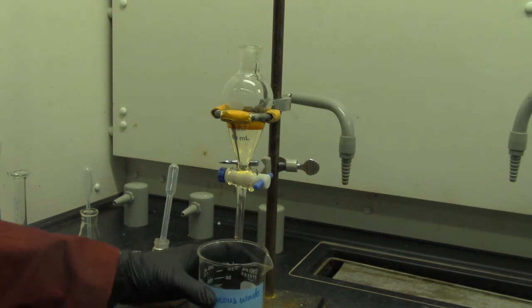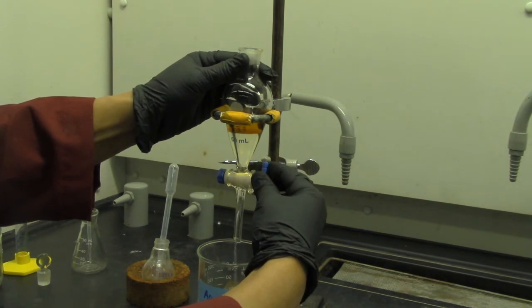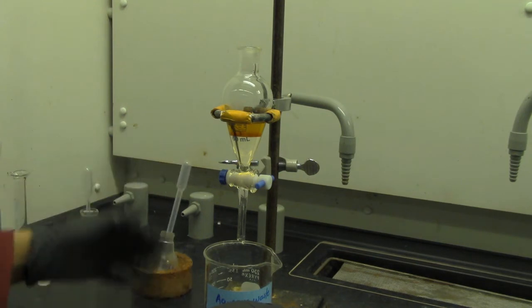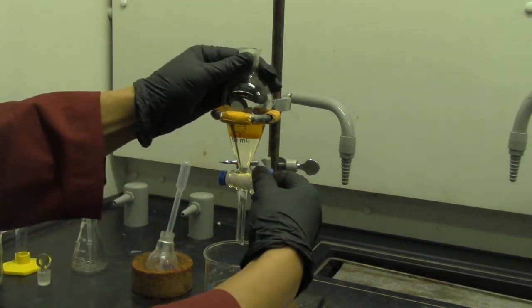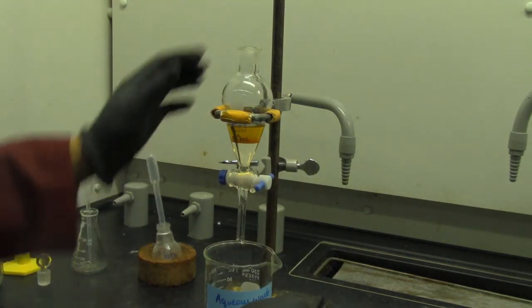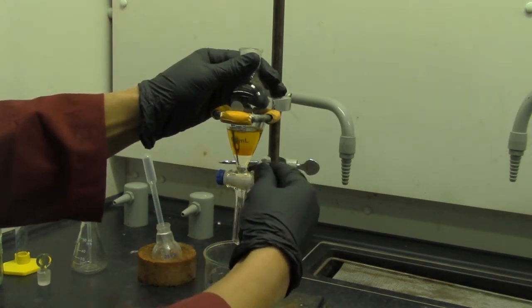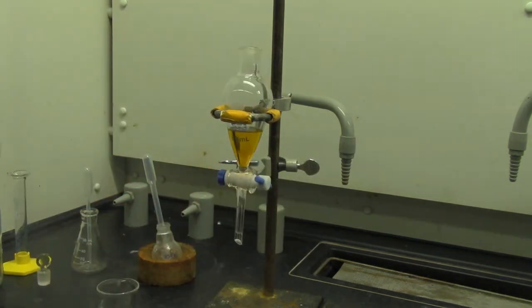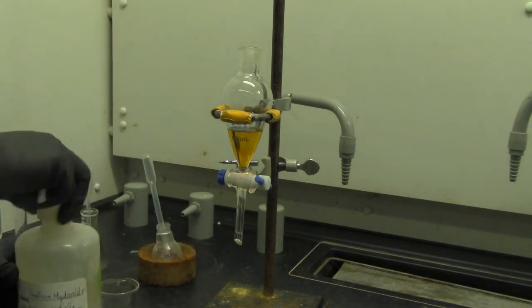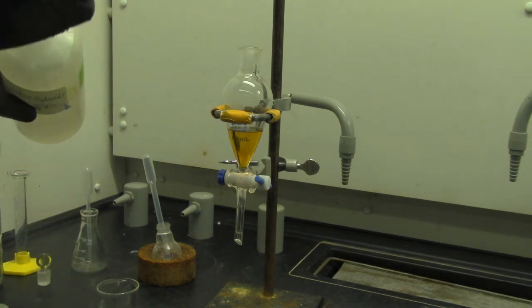So I'm going to drain out the bottom layer, and that is the aqueous layer, right? Okay, so drain that out. You want to drain it out slowly. You don't want to lose the top layer. That's where benzoic acid is, right? So you're trying to extract out the benzoic acid from the mixture. Just open it slowly. Okay. And next we add 5% sodium hydroxide, 4 ml, into this upper layer.